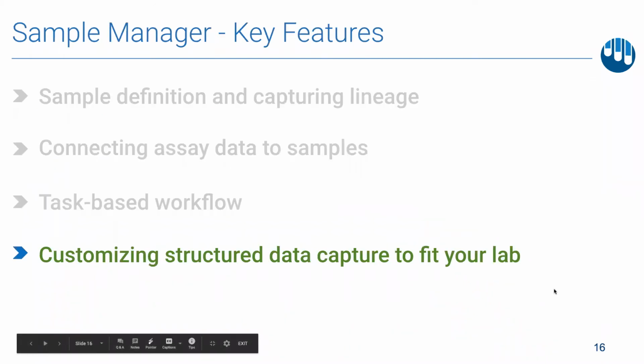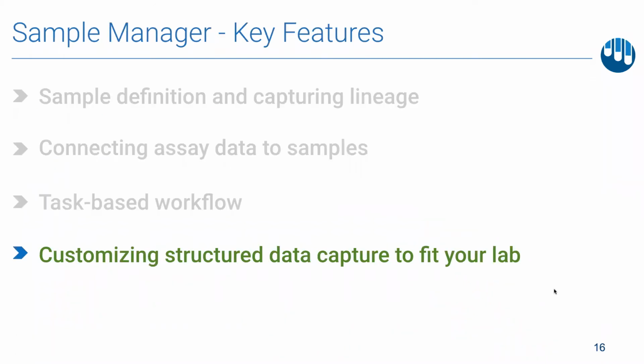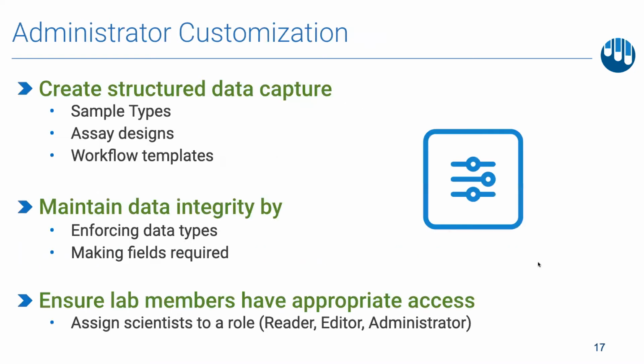So although we haven't called it out as a feature in Sample Manager, customizing the samples, assays, and workflow templates for your lab is important to making the application relevant for you and your team. Lab managers or other administrators can set up Sample Manager to capture the data that is most relevant for their labs.